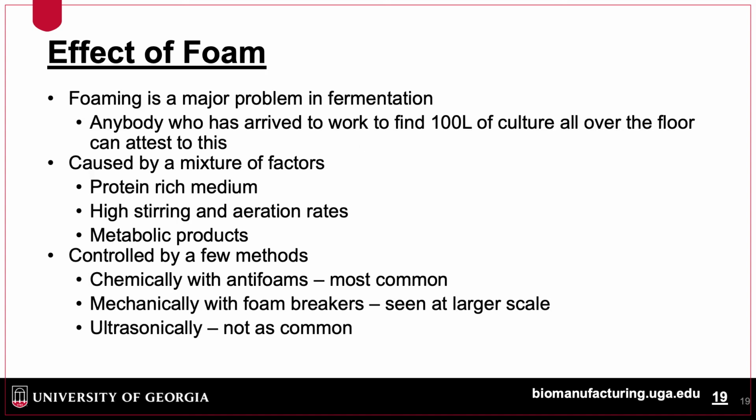Foaming can be a major problem in fermentation. It is caused by protein-rich media, high stirring or aeration rates, and/or metabolic products. It is typically controlled using a chemical antifoam, but can also be controlled mechanically and, to a lesser extent, by ultrasonication.